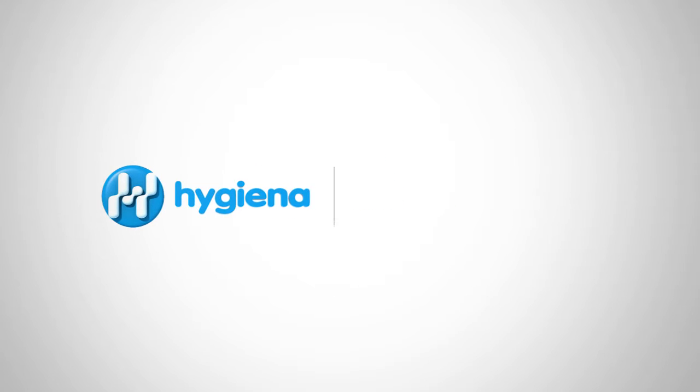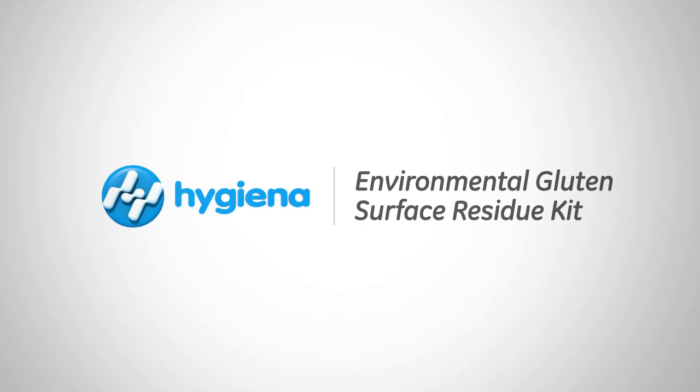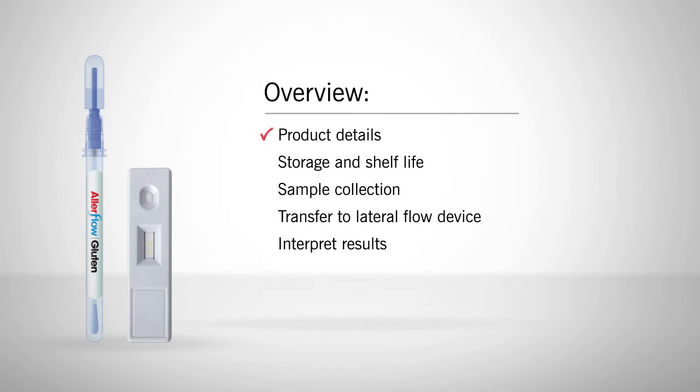Welcome to Hygiena's instructional video on the Allerflow Gluten and Environmental Gluten Residue Kit. In this video we will cover product details, storage and shelf life, and how to properly collect a sample, transfer sample to the lateral flow device, and interpret results.